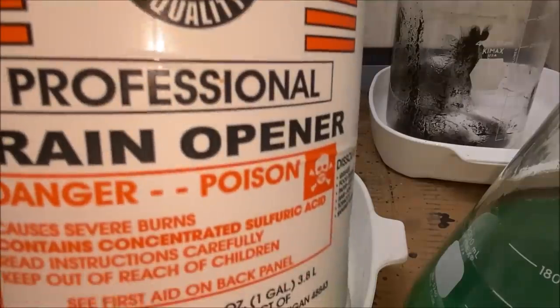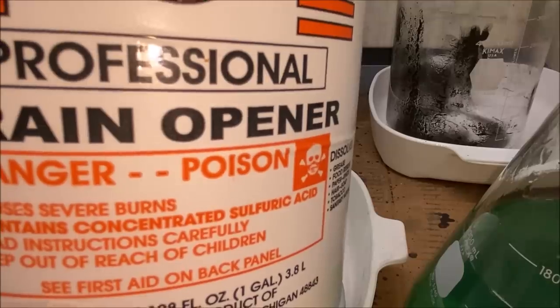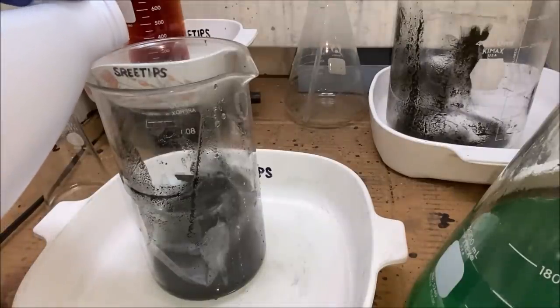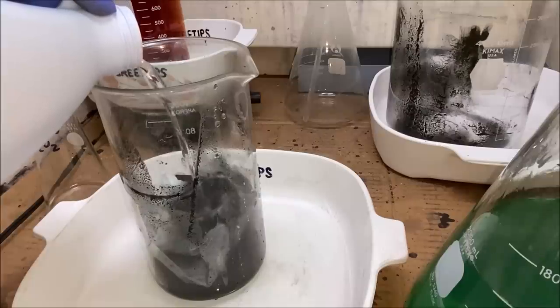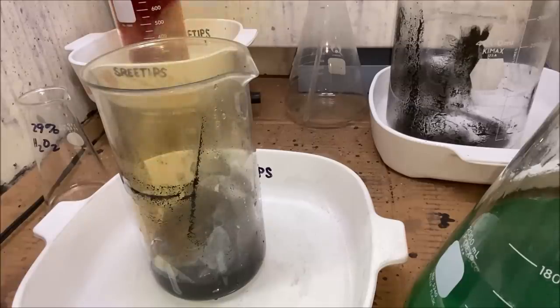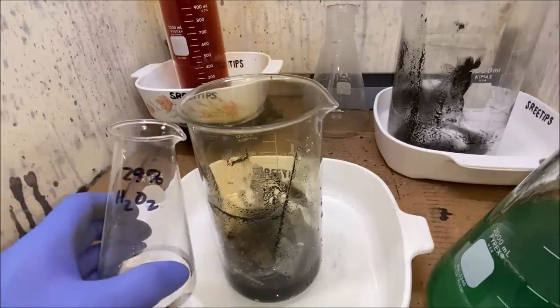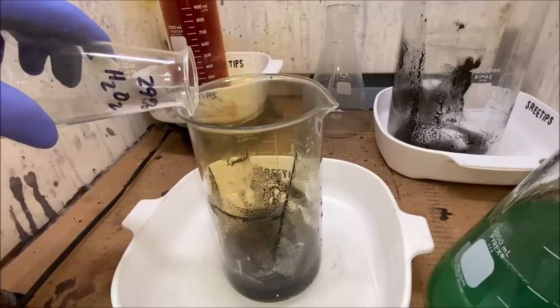Now we're going to add some sulfuric acid to the paper filter that's full of solids in that beaker. I don't know how this is going to react. All right, we're going to start adding some of the peroxide here. Should pretty much just dissolve that paper.